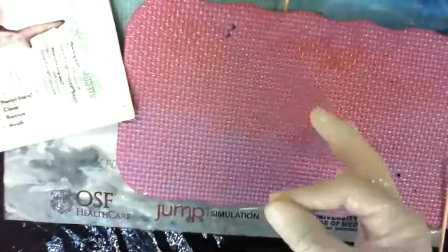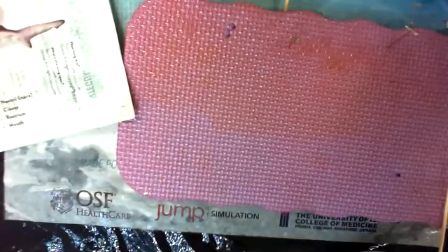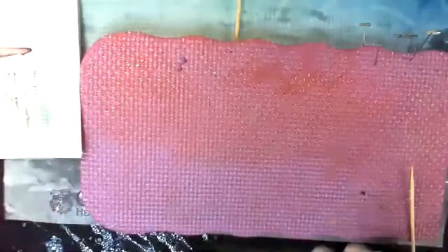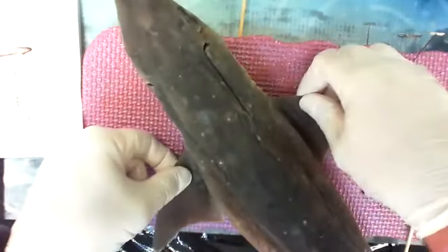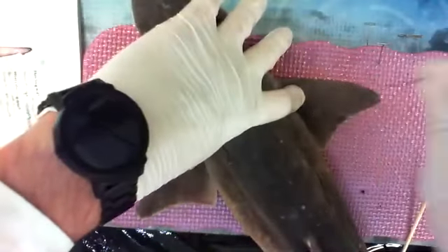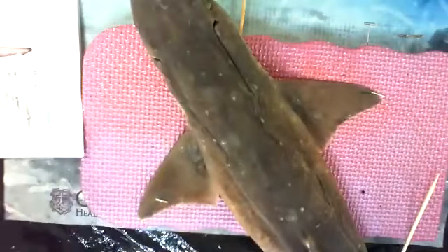All right, I'm taking pins out. 1 pin, 2 pin, 3, 4, 5, 6 of them all together. So 2 up here, don't know what I'm doing. 6. All right. Next, it asks for the wingspan. Remember how I told you the fins are like wings on a plane? You don't want to stick them straight out. You want to hold them so they're comfortable. Hold it, and take those 2 pins, boom, stick them back. Now it's pinned.